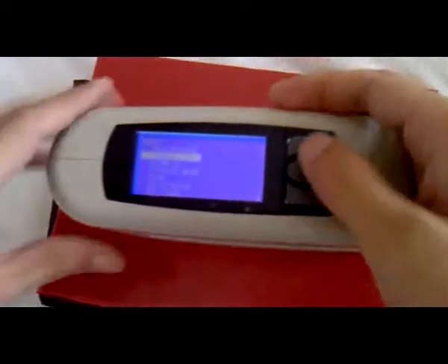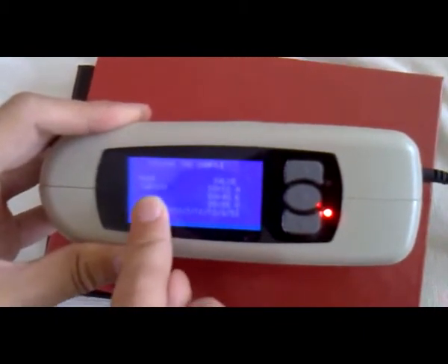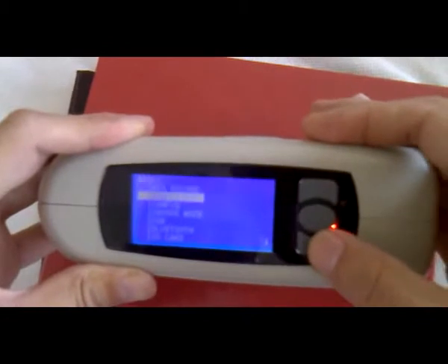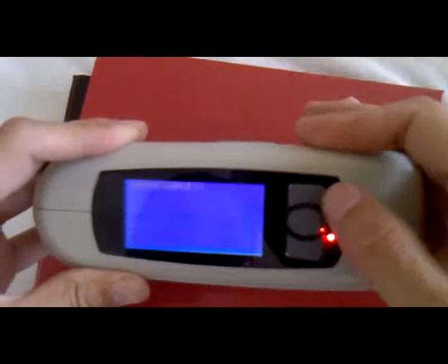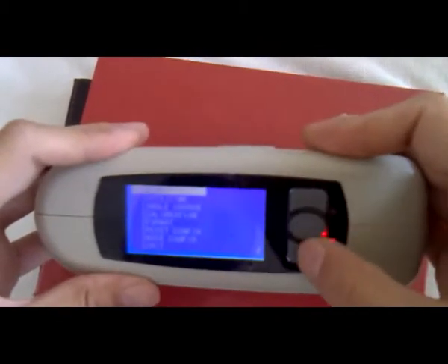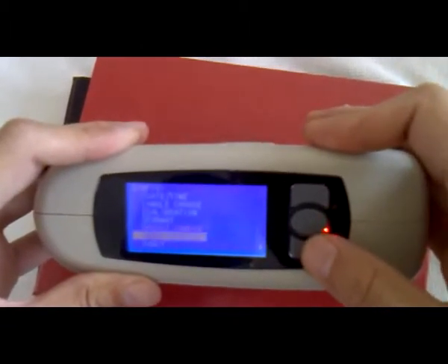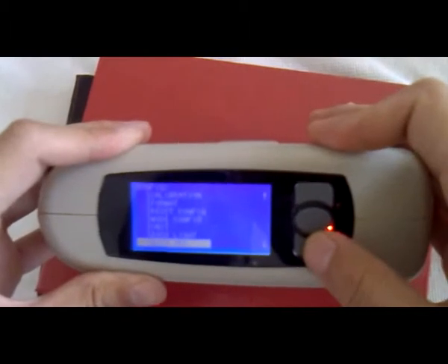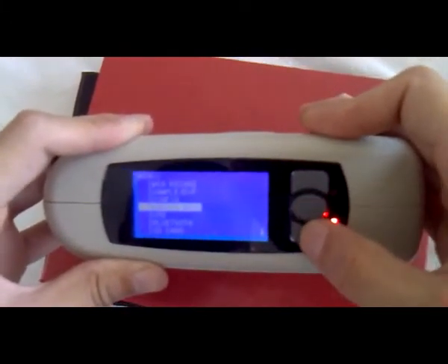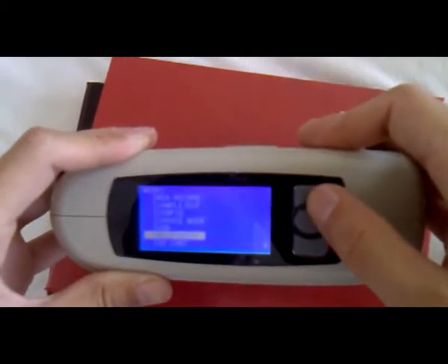Other functions are very easy to operate. For example, this will show the measure sample — just now, we saved sample 001. Here we could set the data: time, angle, choose calibration, format, reset, mode config, unit, backlight, auto off, language. This operation is very easy.